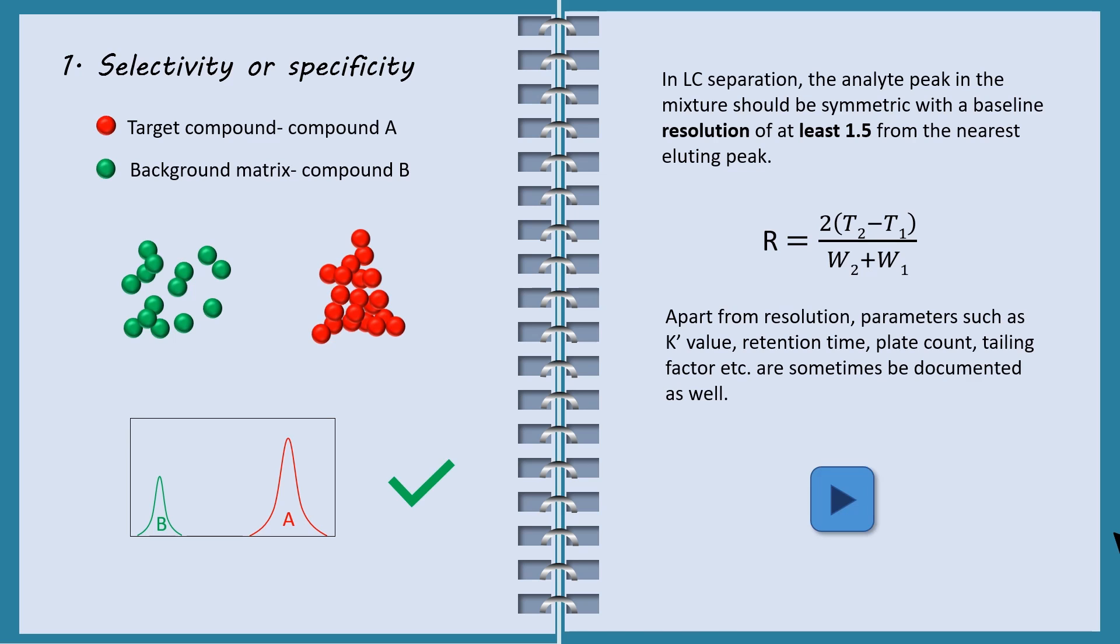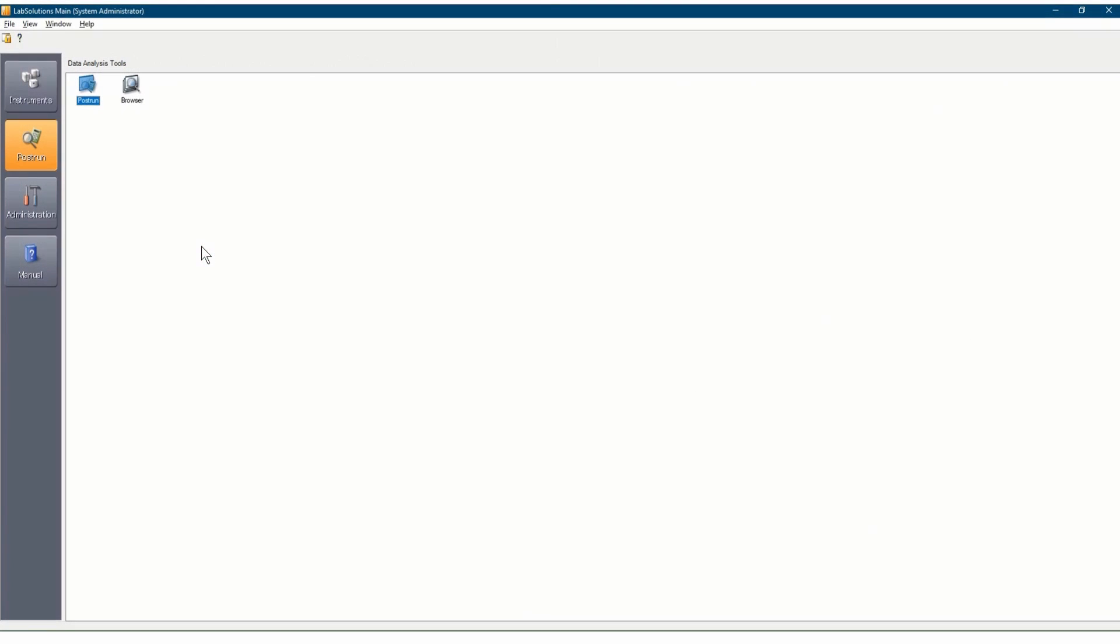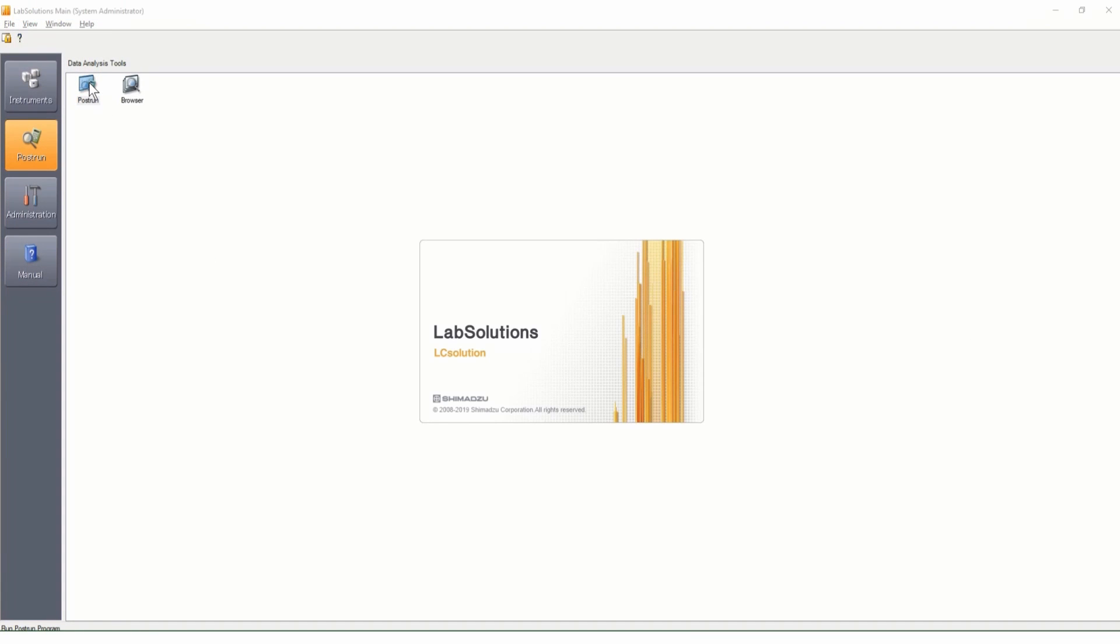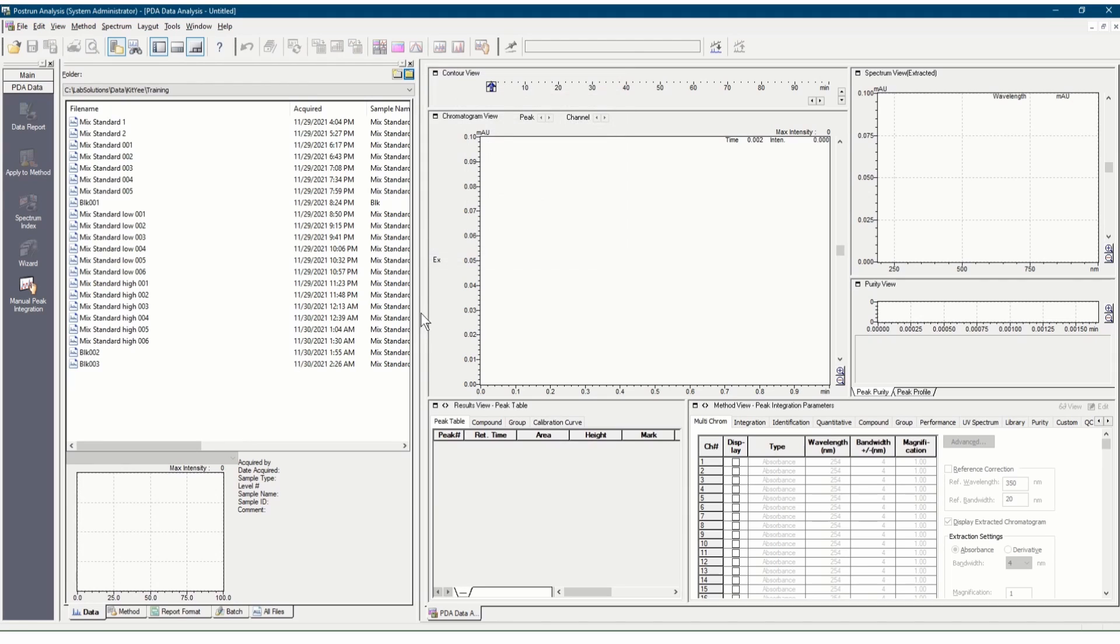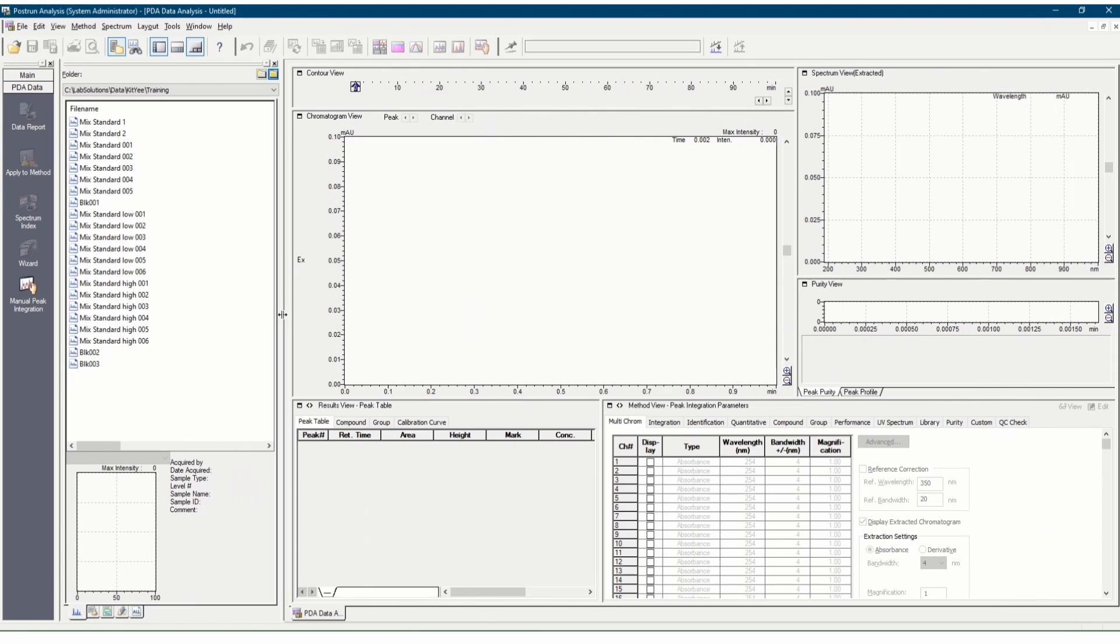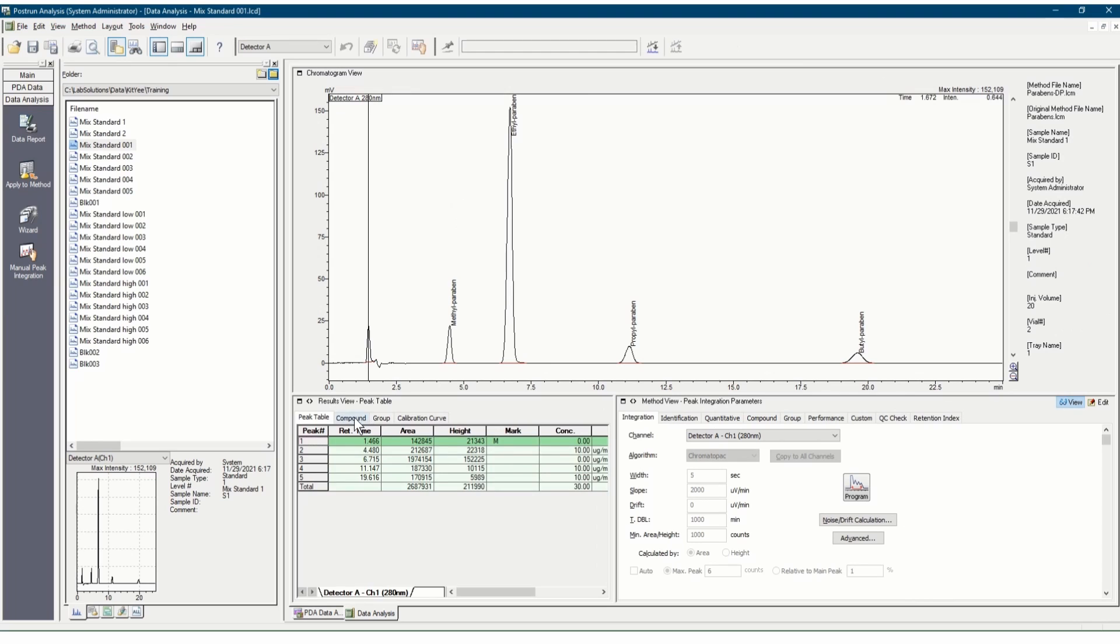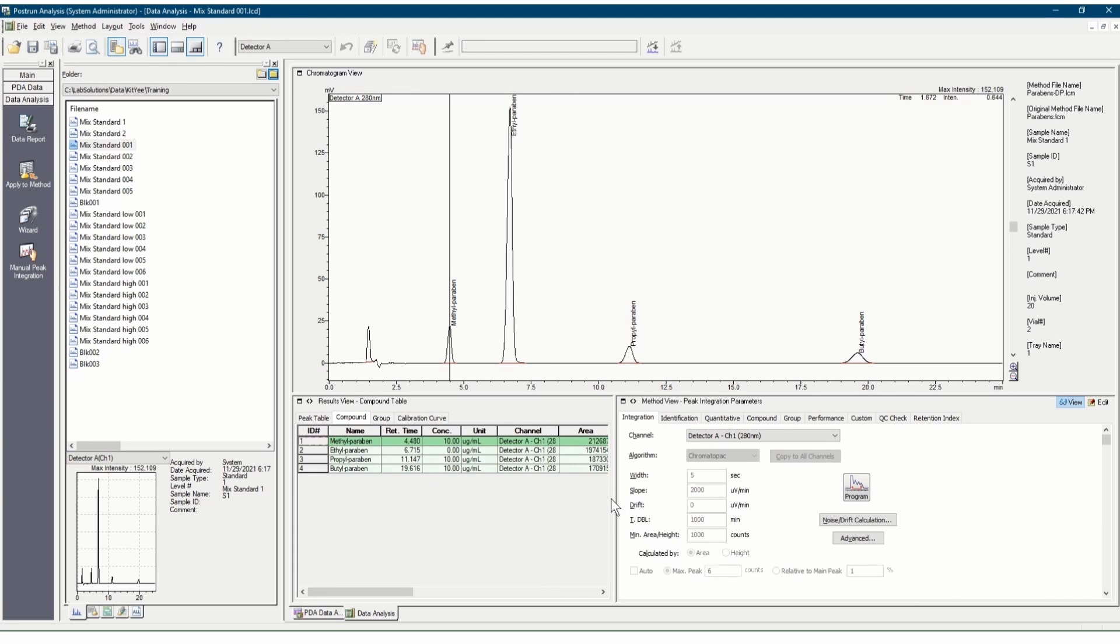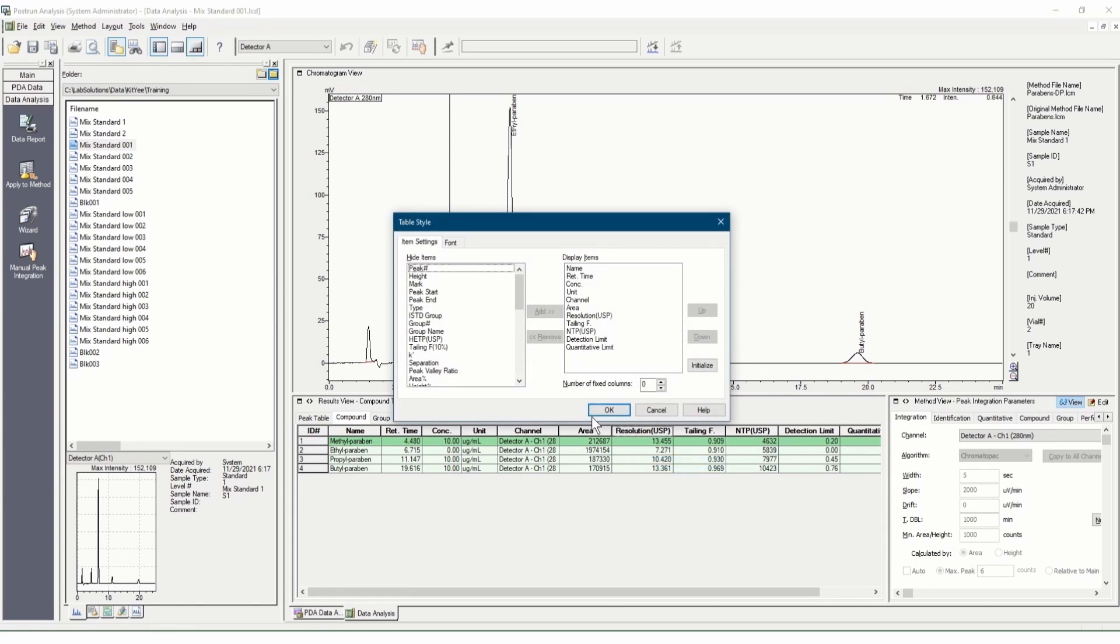Now, let's take a look at how to check these values in LabSolutions software. Double-click the post-run icon to start a post-run sample analysis. Open data file of a standard. At Result View, in the data analysis window, click the Compound tab. Right-click at any point in the table and select Table Style.